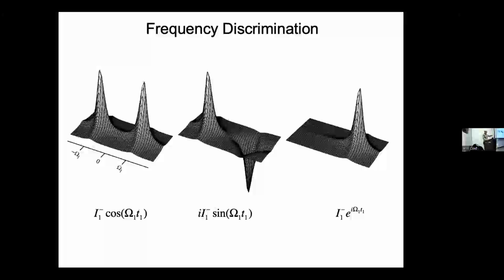We want to know whether the magnetization is precessing clockwise or counterclockwise during T1. We can usually only measure one component at a time, either the cosine component or the sine component. And therefore, we need two experiments in which we measure sine in one and cosine in the other, and then manipulate them to give us the right sense.